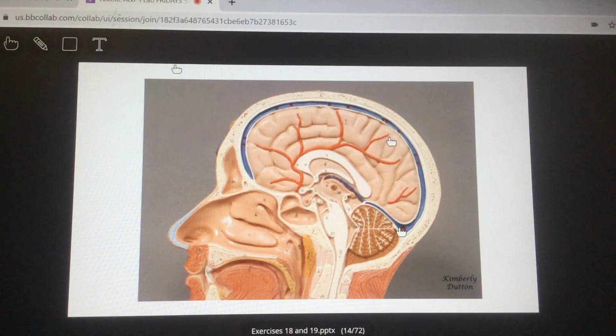Okay. Meninges. Just the white part, right around the cerebrum, right around the brain. Exactly. We can't separate it. It's not detailed enough to do dura, etc. All right, awesome. I'm just going to do one more so we can keep moving because we've already done this.